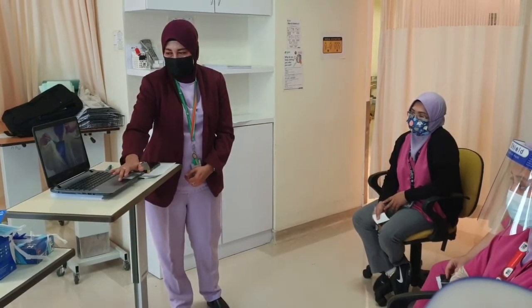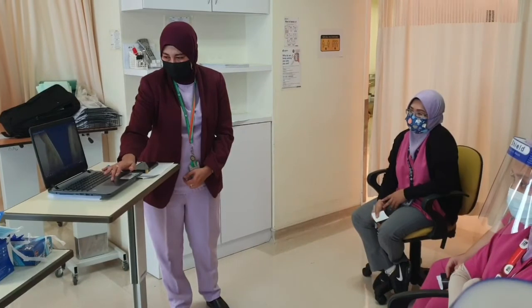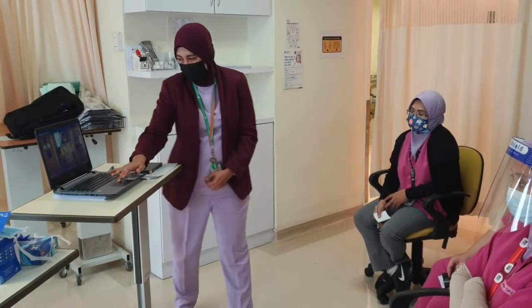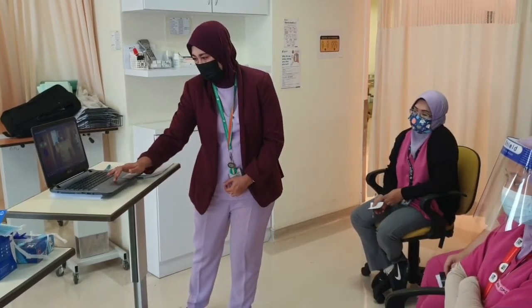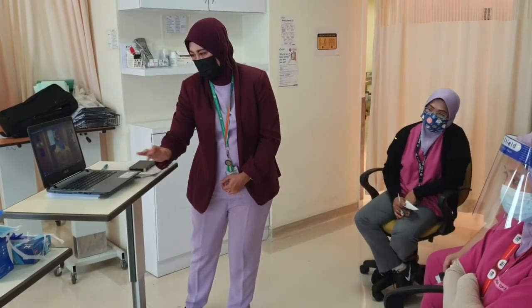Remove your gown by opening it at the neck and then the waist. From the back of the neck, take the gown and slowly pull it out and away from you. Ensure you are only touching the inside of the gown as you roll it into a ball and then place it in the garbage.